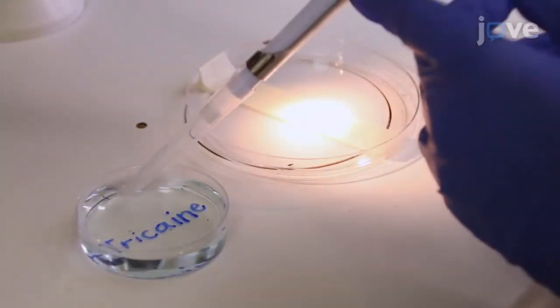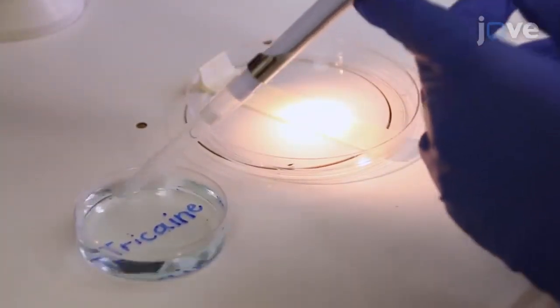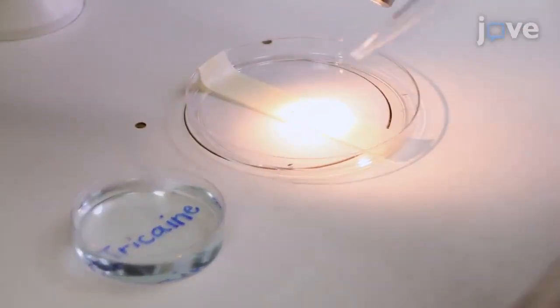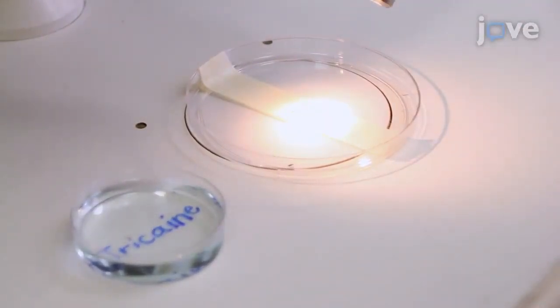Using the modified P1000 micropipette, pick up an anesthetized zebrafish larvae and place it onto the positioned autoclave tape on the petri dish lid.